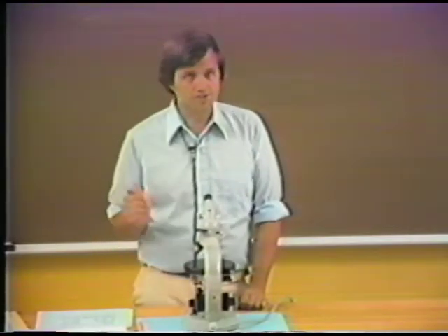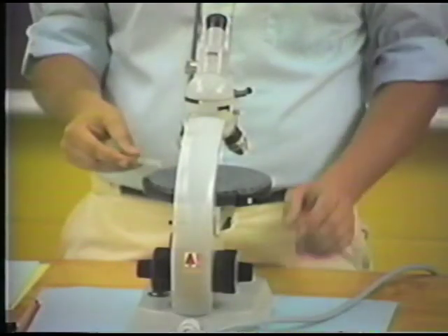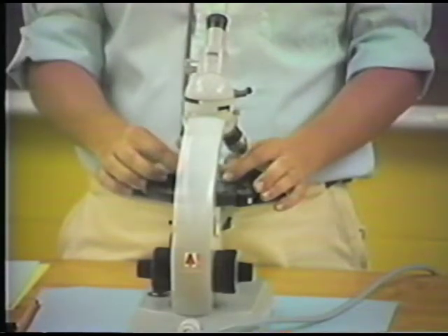So you either see addition of colors with the accessory plate or you see subtraction. Well, let me demonstrate the same test now using the mineral melilite.